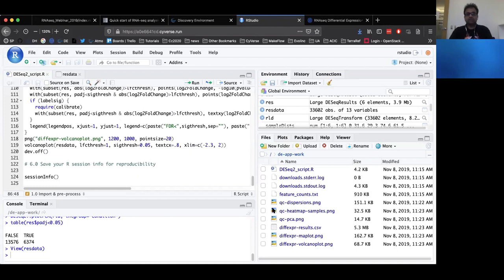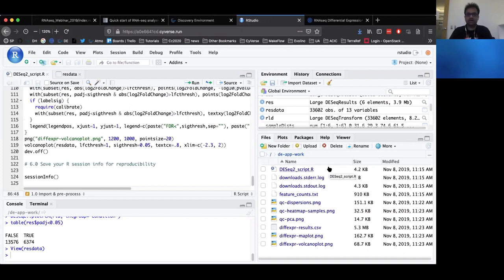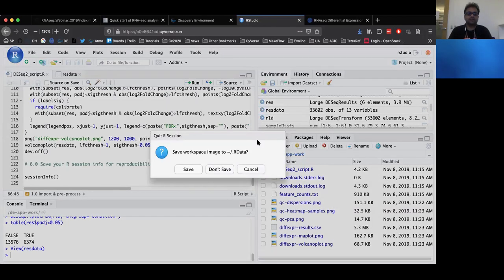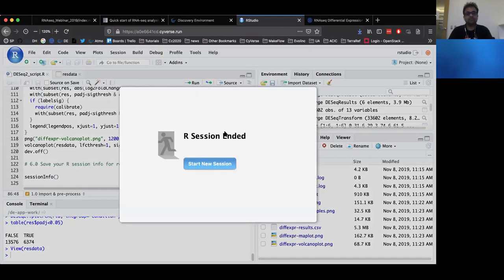We have run through the DESeq2 script and we have quite a few plots and differential expression results, starting from raw data uploaded into the Cyverse data store. Now that we have finished differential expression analysis, it's time to save our work. In the top right corner, there is a power button that says 'quit R session.' It's going to ask you whether you want to save the workspace image — in this case, we are going to say yes. You will get a notification that the R session has ended.